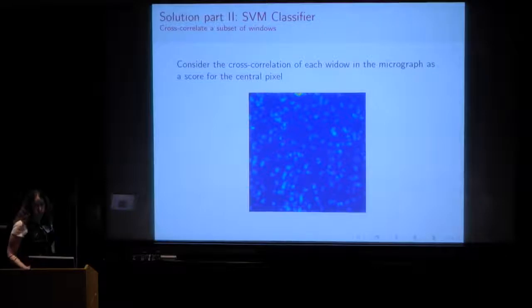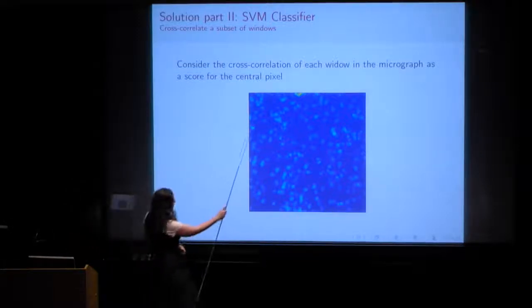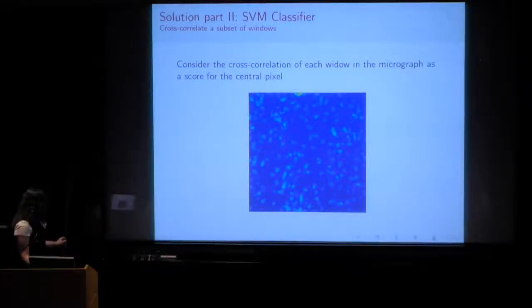And then we went onward to improve, and we said all this works very well, but we don't actually have to do this cross-correlation scheme with each window in the micrograph. We can just do it with half-overlapping windows of the micrograph, right? Because then we'll still find each one of the particles, because even if one window is kind of here and only gets this small part, the next window is going to capture the particle very nicely. So this is actually what we do.